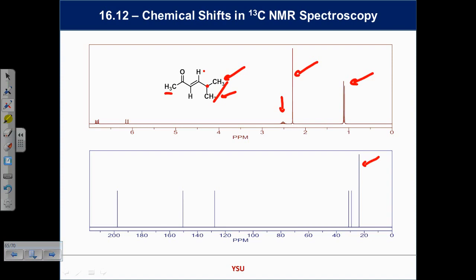them. Maybe this one is allylic. See, that one's allylic. This one is alpha to a carbonyl. They've been dragged downfield. Now in the C13 spectrum, it's not as dramatic, but they still are further downfield than the methyl groups. It's still consistent.